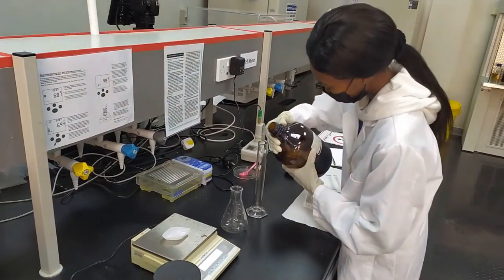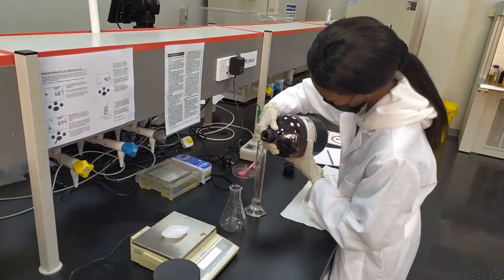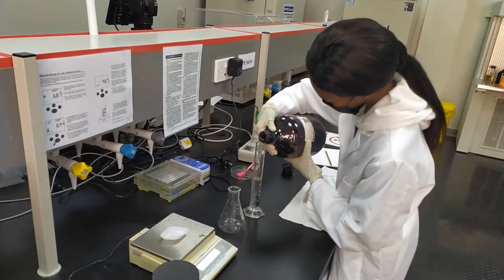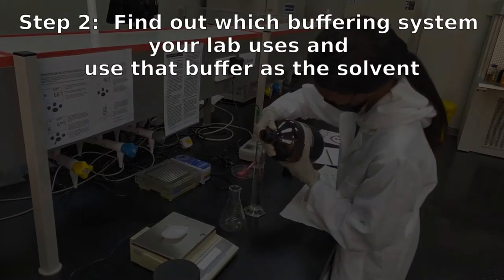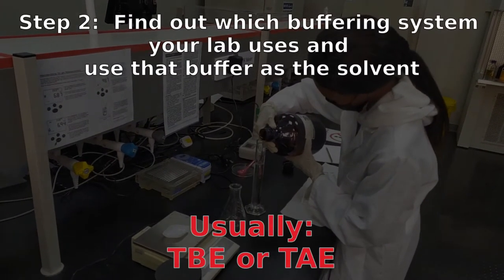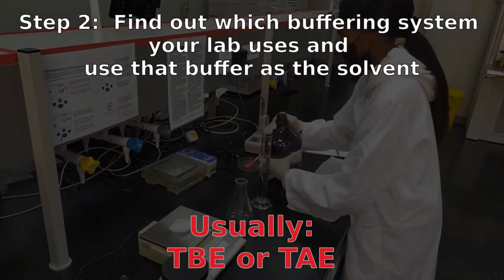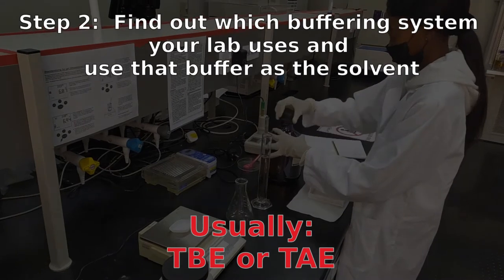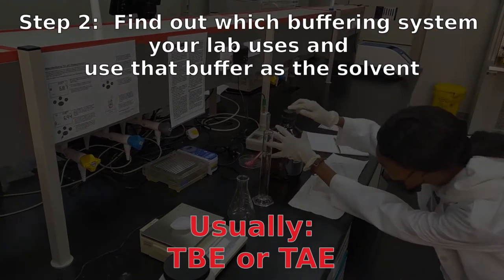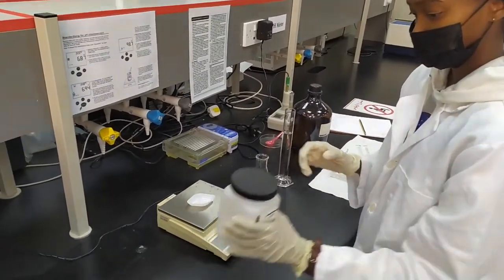Now that we have our calculations done, we can start to prepare the solution. The first thing you want to do is check what kind of buffering system your lab will use. So, it's usually either a TBE buffer or a TAE buffer. You should never use water. Always make sure you are using the buffer that will be used for running the gel. So, once you have that buffer selected, you can measure that out.